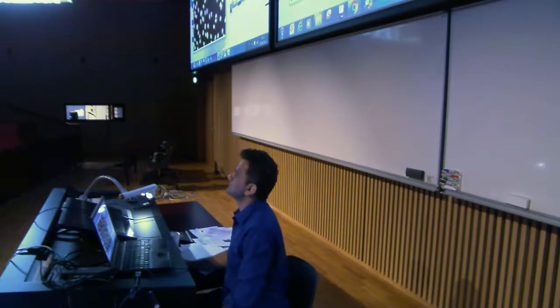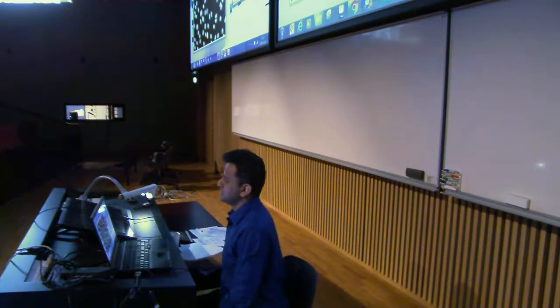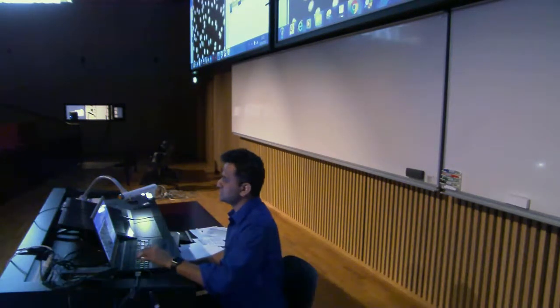Yes. Can you manually add stuff in there? Yes, you can. So you just go here. Let's say, imagine this is a nucleus which you wanted to segment, but you couldn't. So just select this and then say add it. Now it is added. And it should add actually somewhere. That is added. You see here?